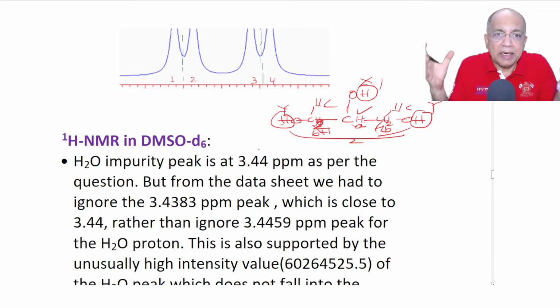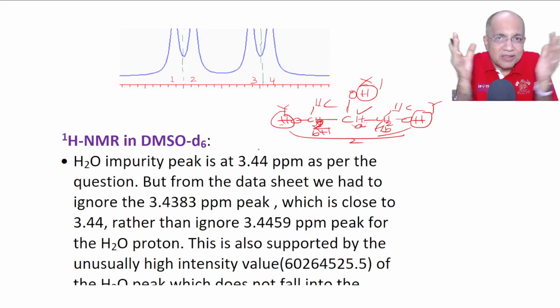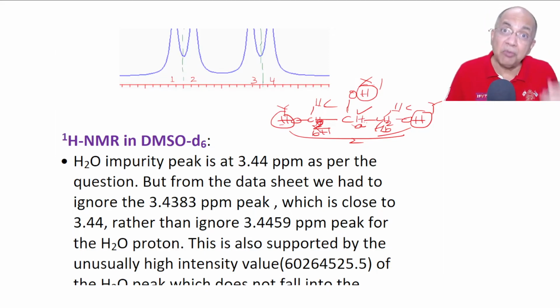But in this scenario, when they are very close, coalescence of some components definitely must have happened, so that instead of 6 lines, we are getting 5 lines. But don't worry, we know it has to be a doublet of triplets. So that cannot be, because the same compound we have already identified in D2O. We have identified it.